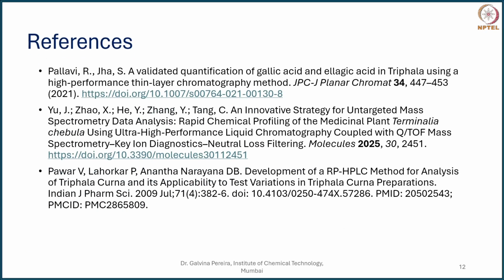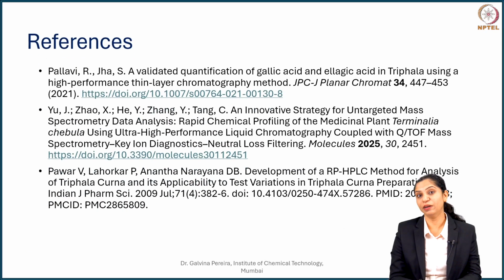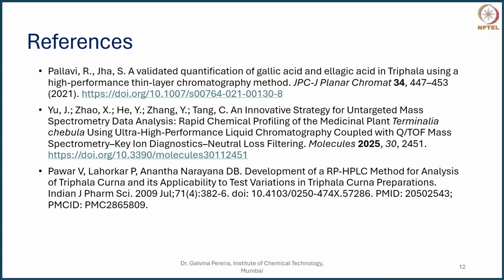So here are a few more references if you wish to read more about standardization of your harda extracts. In market nowadays you have tannin rich extracts to the extent of 70% polyphenol content. So yes, all these methods are going to help you standardize and recheck whether a company claiming 70% standardized extract is actually giving you 70% or it's much lesser.